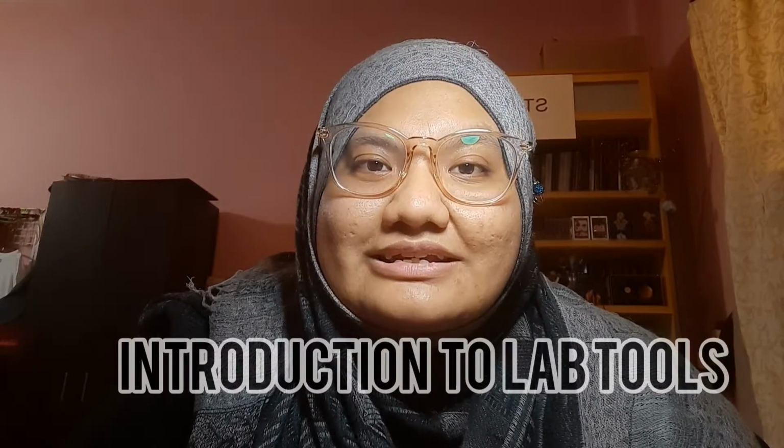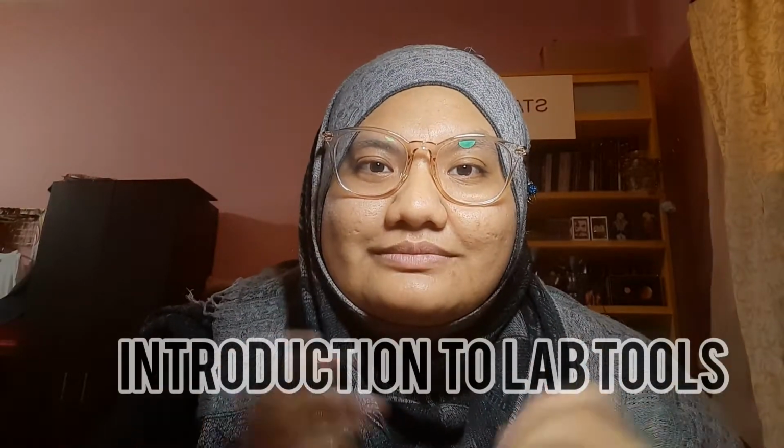So our topic for today is introduction to lab tools. I'll be teaching you the equipment and the tools we use in the lab for experiments.